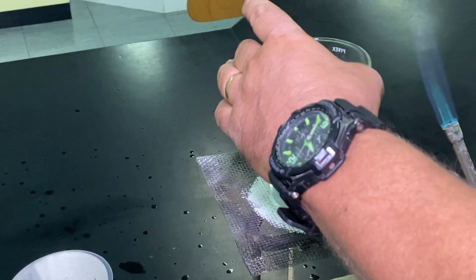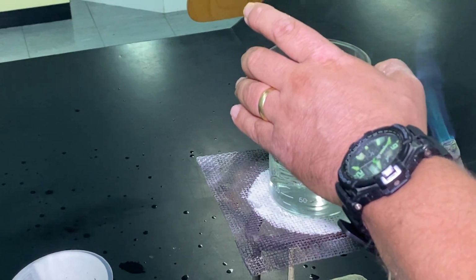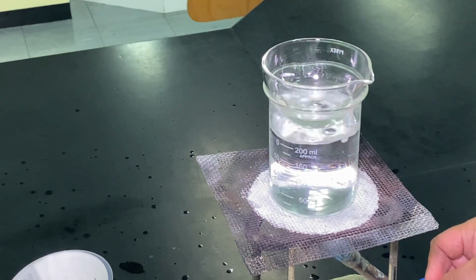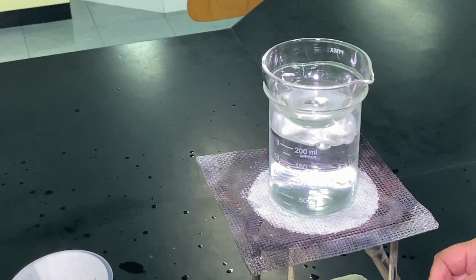It'll take a bit longer. You can just about see, I think, crystals starting to form around the edge of the hot sodium chloride solution.